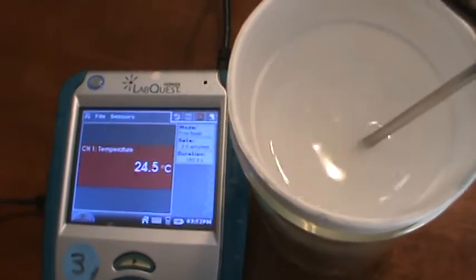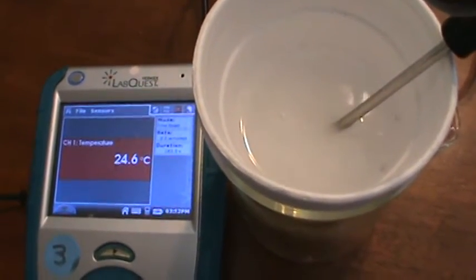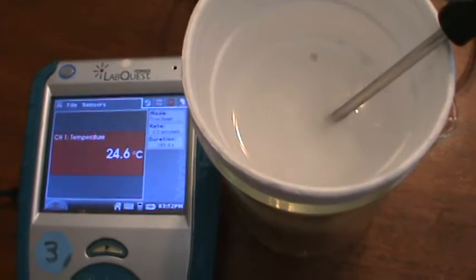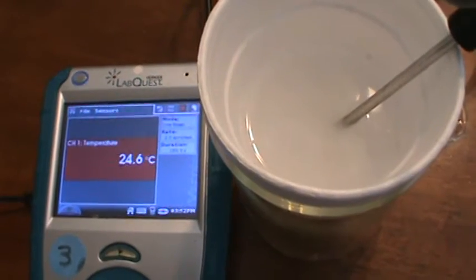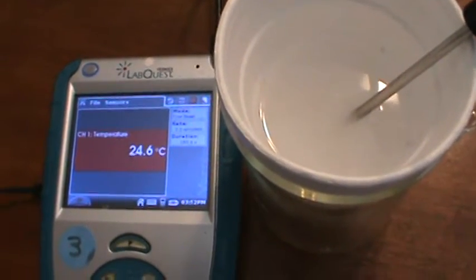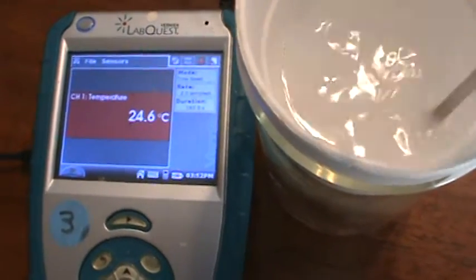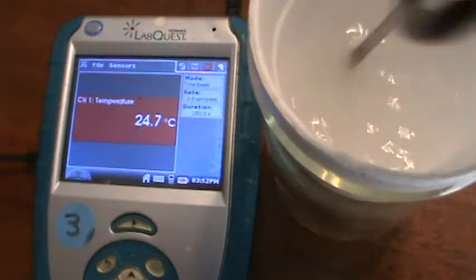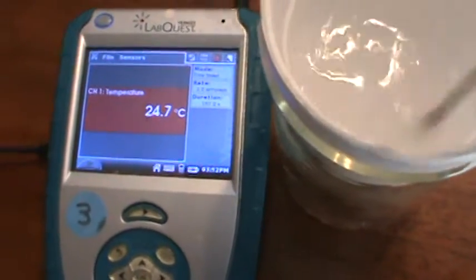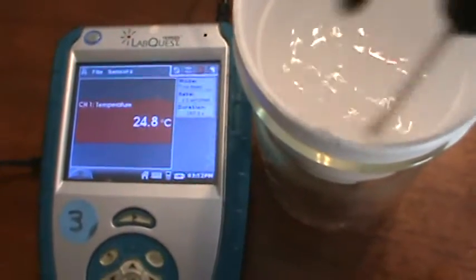All right, you guys are just watching this, so I'm actually going to upload a picture when this is complete, okay? And I will take a photograph, I think. Well, actually it's almost done, I think. See, shavings are getting very small. If I'm patient for just another moment or two.